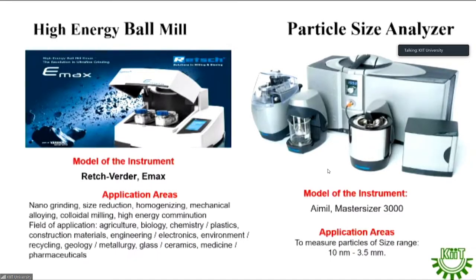A lot of investigation can be carried out, starting with nanoparticle preparation, nanoparticle characterization, and nanofluid preparation and characterization. So these instruments are basically used for this, and students are actively engaged in research on these activities.